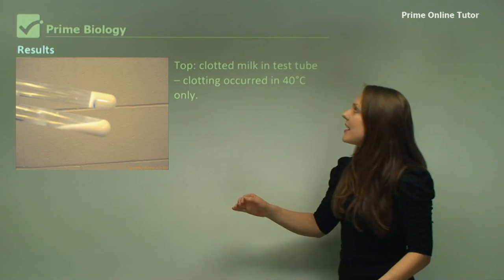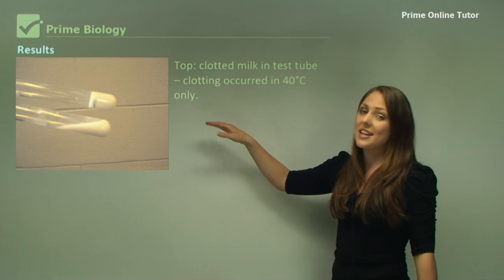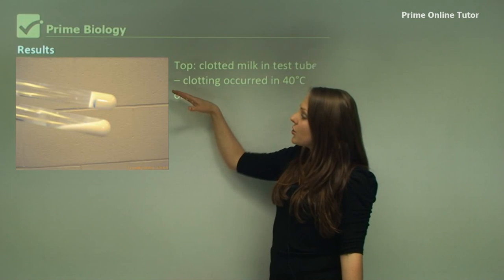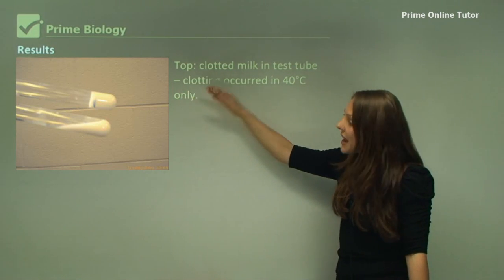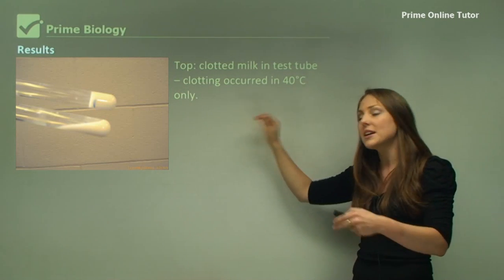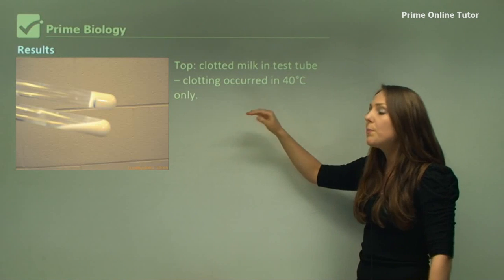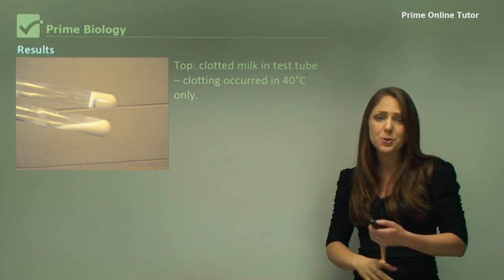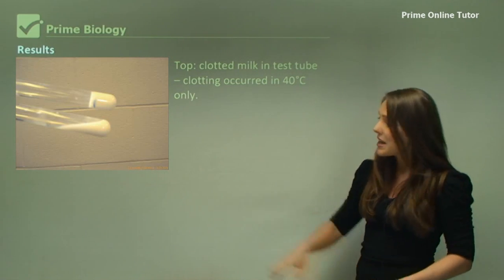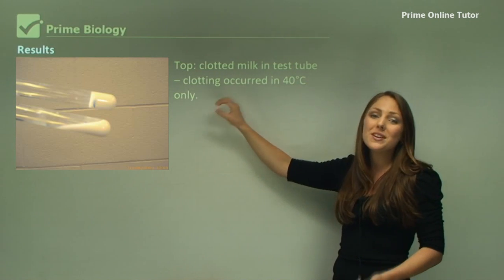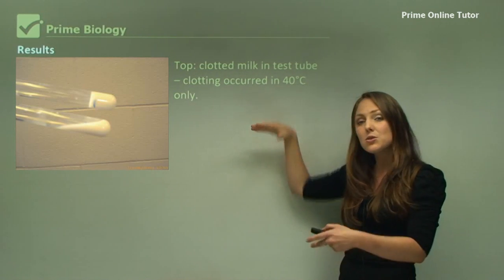We can see here that at 40 degrees you can see that the top test tube has clotted and the bottom test tube, the milk is still quite liquidy. The bottom test tube has either come from a zero degrees or 80 degrees environment, but the top test tube, the milk is a hundred percent clotted. It is not liquid at all and this has happened in the 40 degrees water bath.